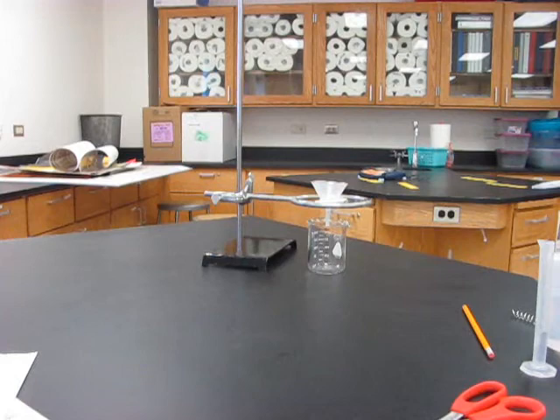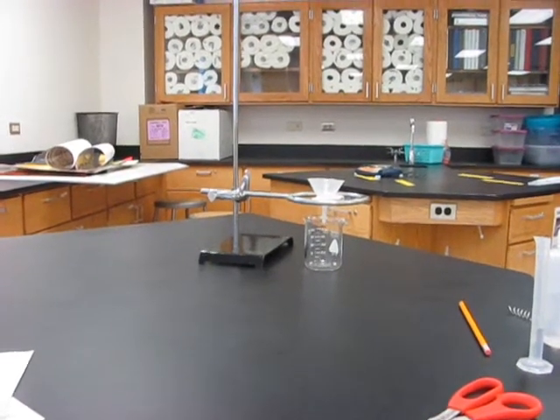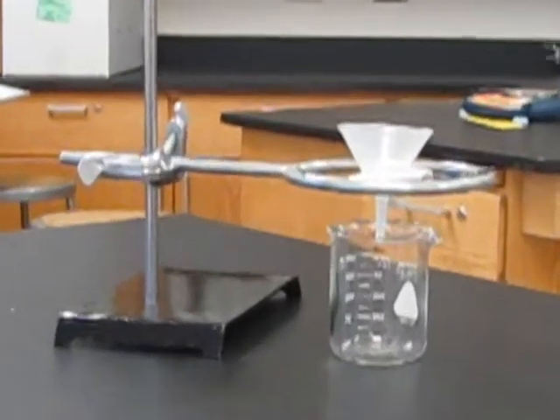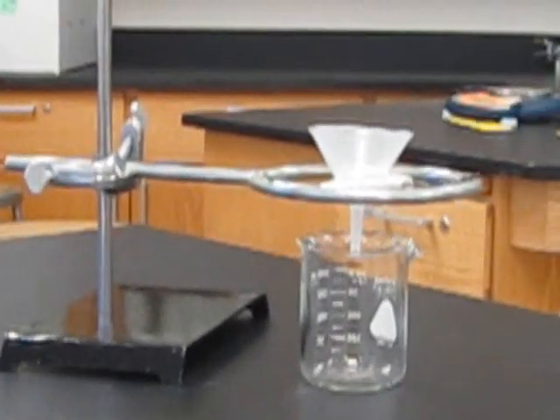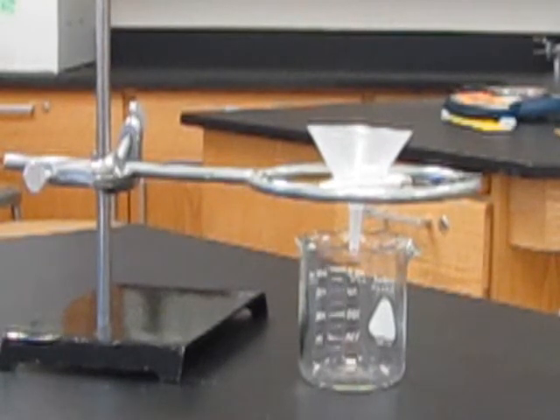For step 12, you're asked to do some filtering. This is what your setup will look like. You will take a ring stand. You will place an iron ring with a clamp. On that iron ring will be a clay triangle, and the funnel will sit through it. Underneath will be a beaker that will be collecting the waste material. Your filter paper will fit inside the funnel, and you will pour directly into that filter paper.